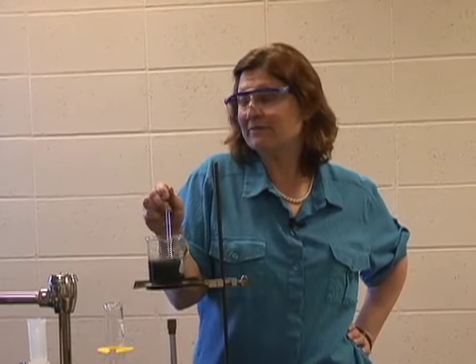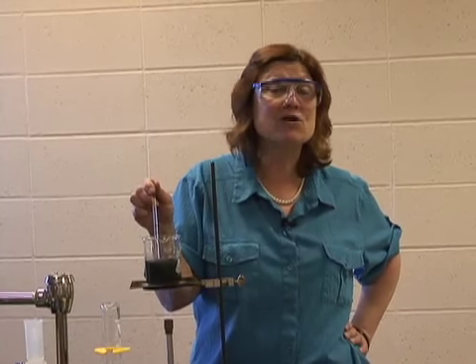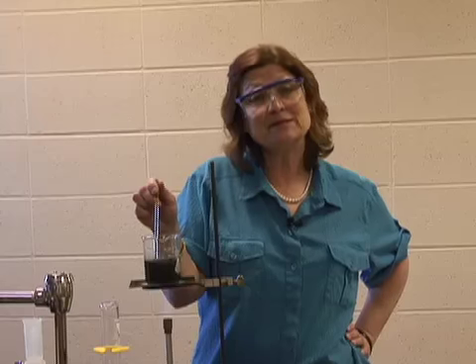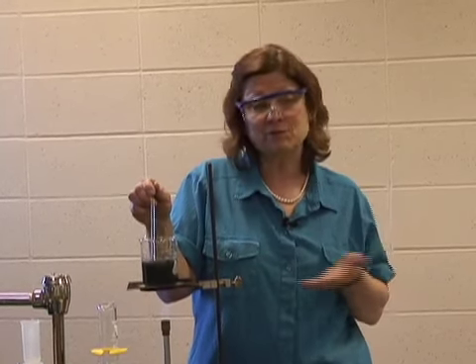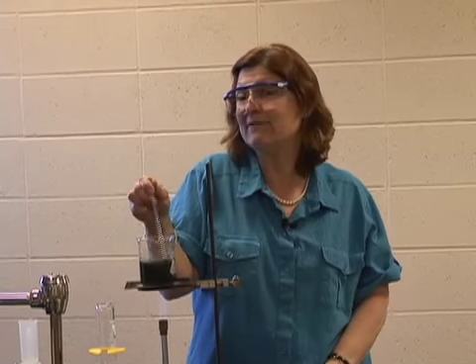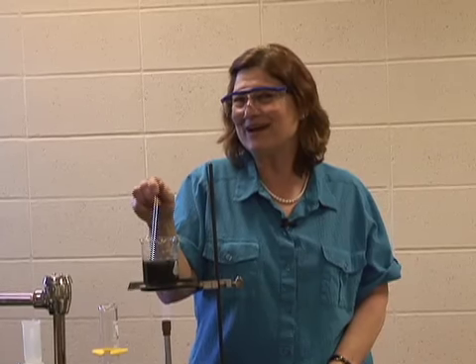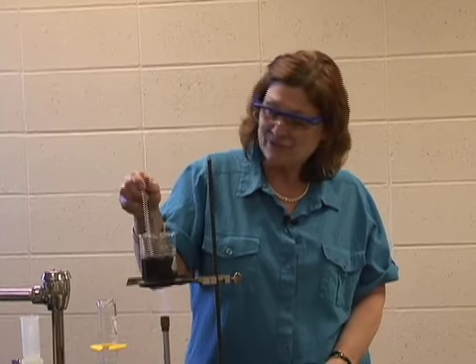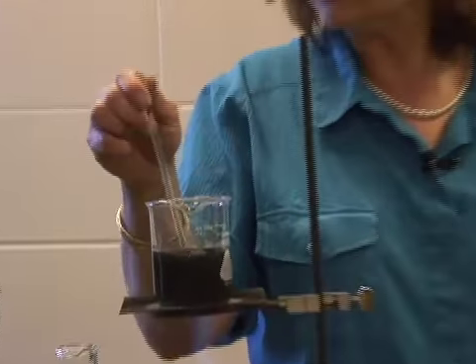Now, it would actually have been fine to let it sit overnight. It would have also turned black. But this lab is designed to be done straight through in 2.5 hours, so it would be necessary to heat it because you wouldn't have the time overnight. So we need to use the Bunsen burner. I'm not going to eliminate that part. And there we have it. It's all black. And so I am finished for today.